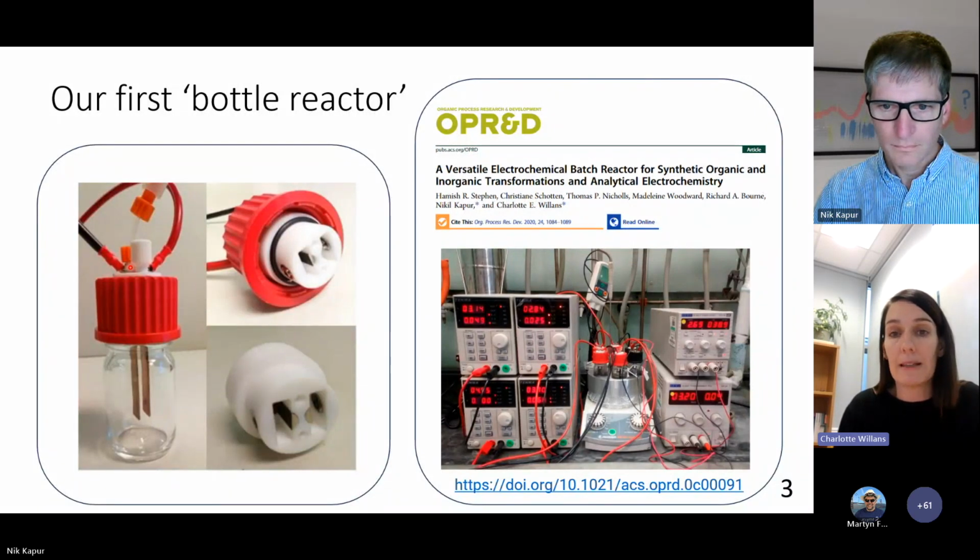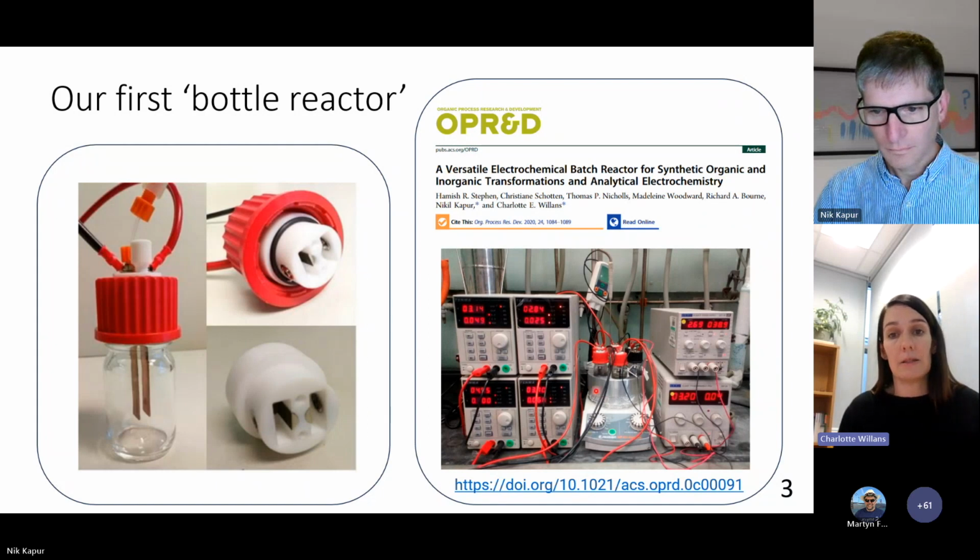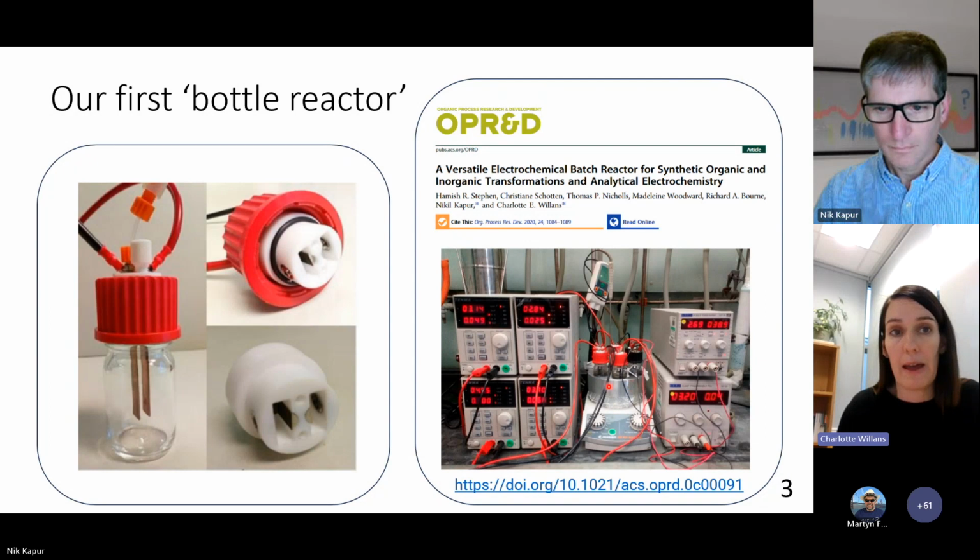And you can see on the right hand side, we also machined a plate that sits on a stirrer hot plate so that we can do 6 reactions in parallel on there.